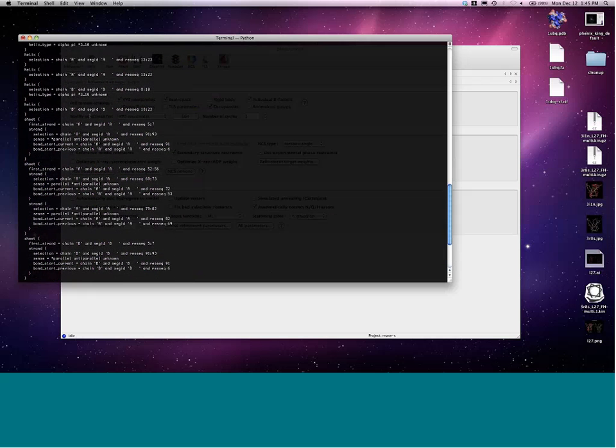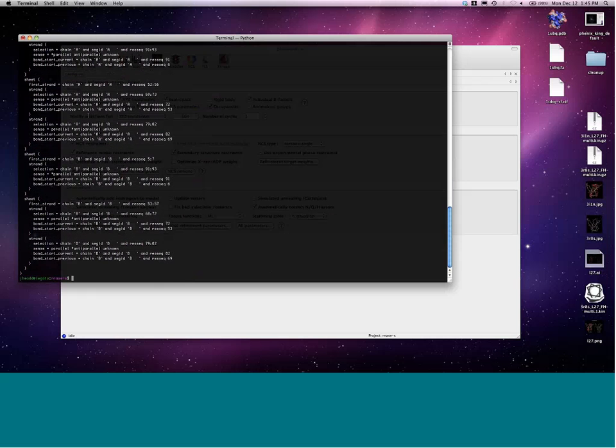And so you can save this output from running the command on the command line. You can save this in a parameter file, and if you pass that to read that in as another option during your refinement, you can use that to define them ahead of time. This is what Phenix would do automatically.